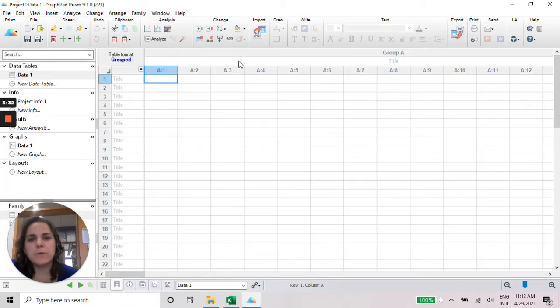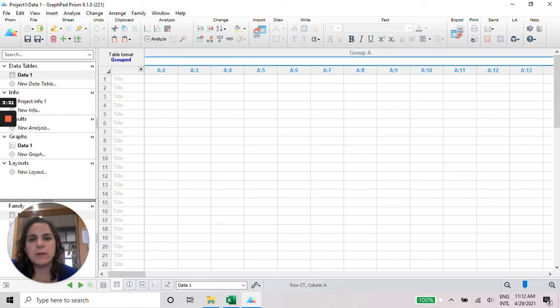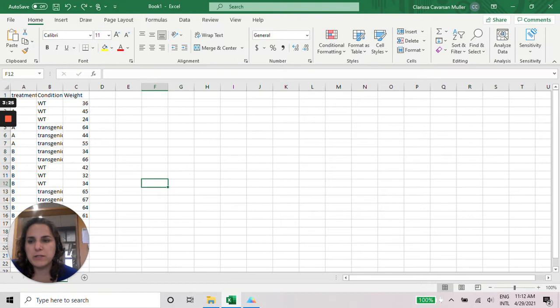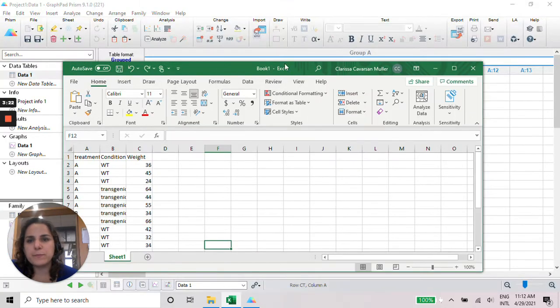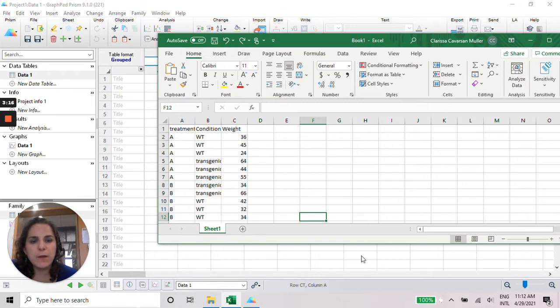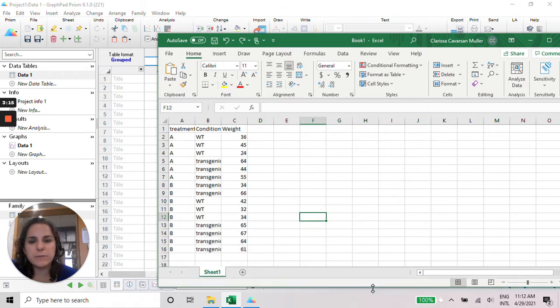So in the first one here, I'm going to base this graphic in this spreadsheet, where I have treatment, condition, and the data of weight of these animals.